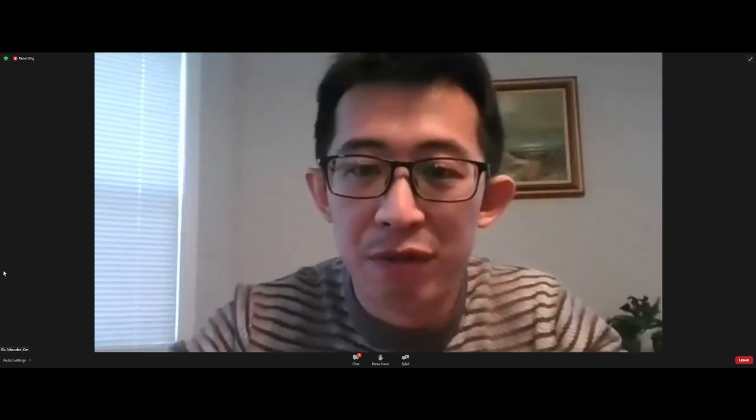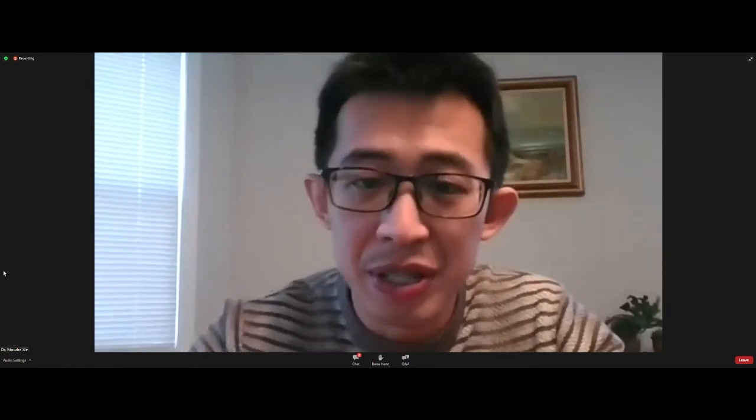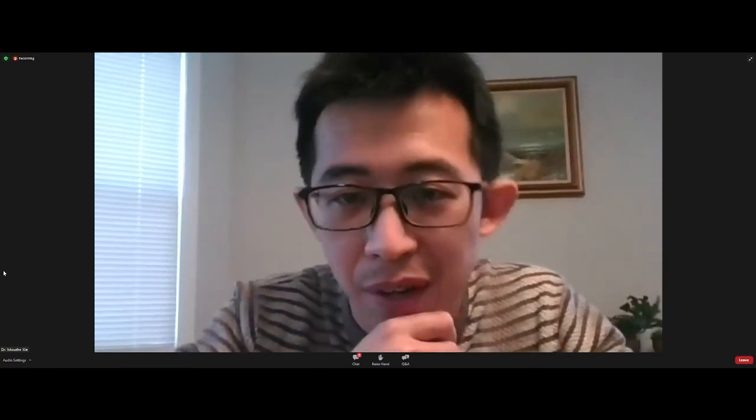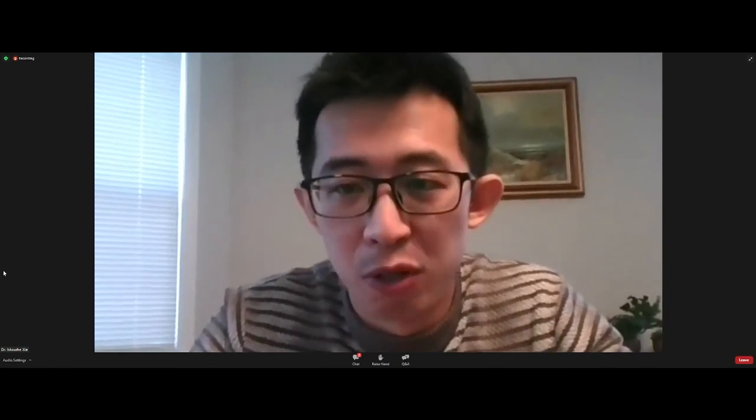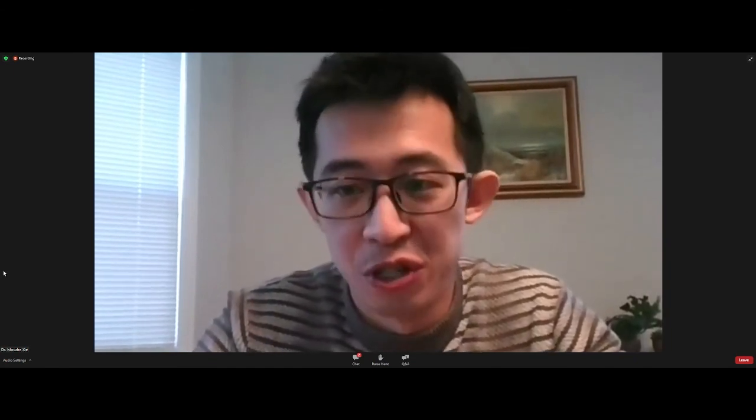Yeah, great. Another question from an anonymous attendee asked, I guess it's pretty general, do we require a technique like DNP to overcome sensitivity issues? So I would say, yeah, DNP is great. It really enables us to look at all kinds of proteins that otherwise would be too difficult, because you can't make enough of it or the concentration is really low.